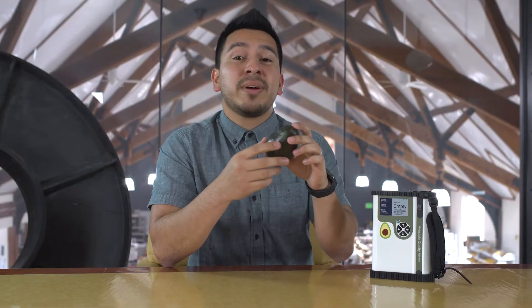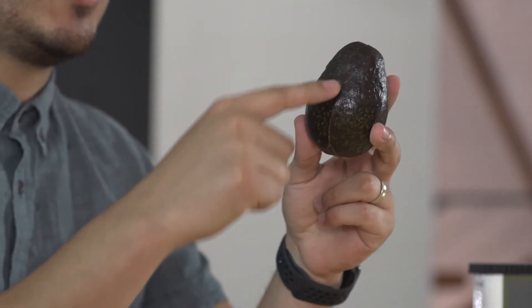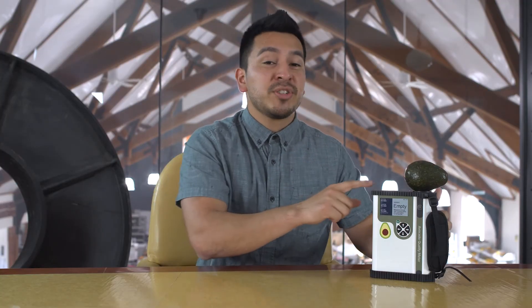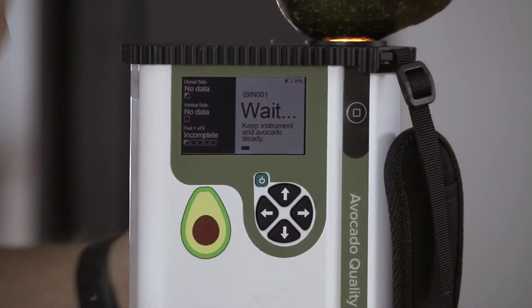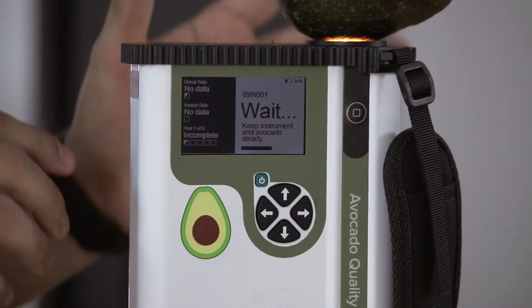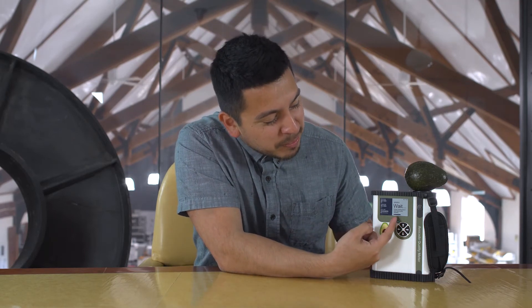We also recommend that the measurement be taken at the equator of the dorsal side of the avocado. A measurement is as easy as pushing the measurement button. During this time, it is important to avoid any movement of the fruit or the instrument for the best possible results. The progress is displayed at the bottom of the screen.